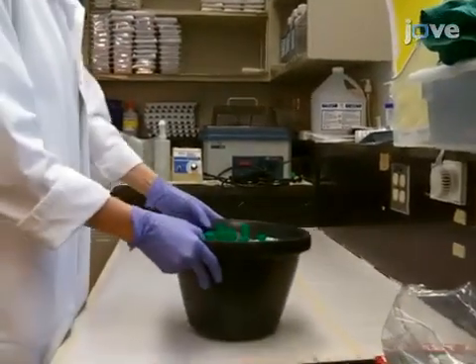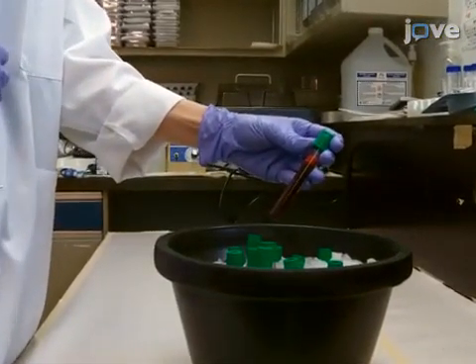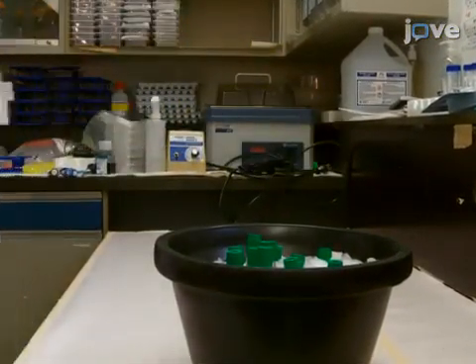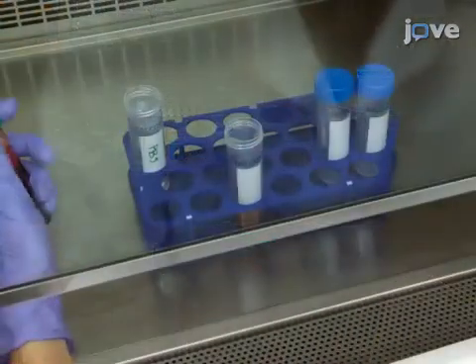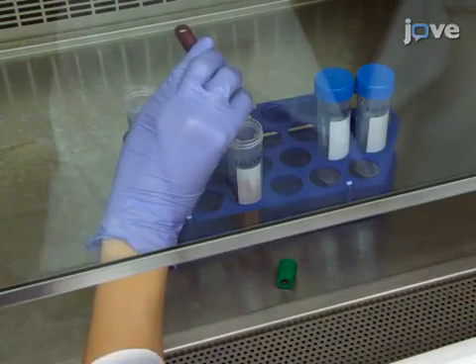To begin, obtain 80 mL of fresh human whole blood in 14 heparinized green top tubes as described in the text protocol. Open each tube and add 5 mL of PBS without calcium and magnesium to each tube.